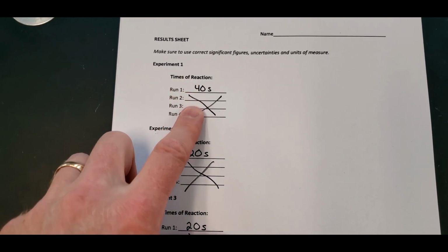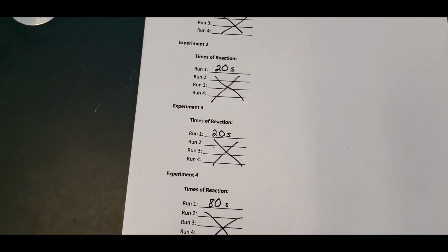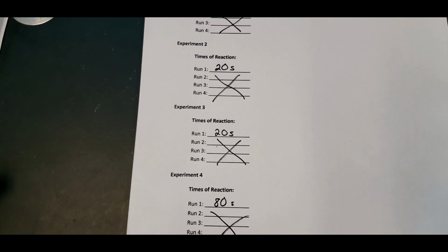So we have 40 seconds, 20 seconds for the second experiment, 20 seconds for the third, and 80 seconds for the fourth experiment. Then I'm just going to go through the calculation sheet. It explains everything, and it asks you to do these certain calculations. So that's what I'm going to do. I'm just going to go right through this. So make sure that you have your lab sheet ready, the document, and go to the calculations.